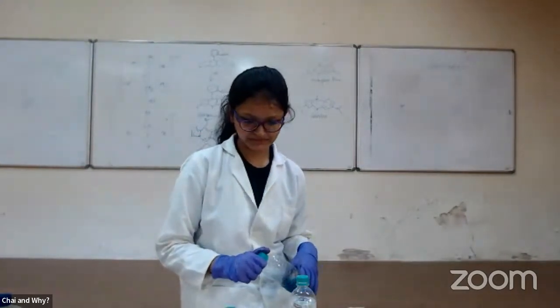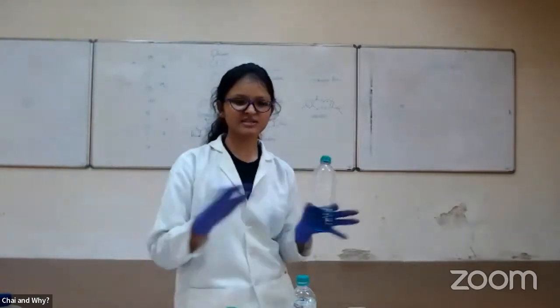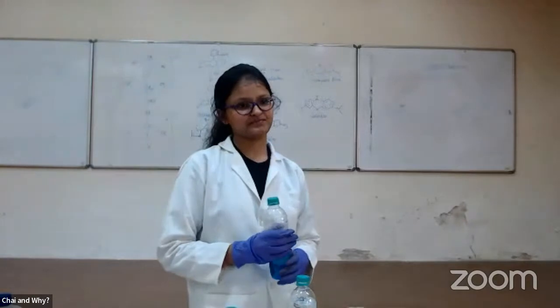Okay. All right. And is that process exothermic or endothermic? Somebody wants to know. I don't feel it's anything like that. It's just a room temperature reaction which does not involve heat, I would say. Okay, not much. All right.